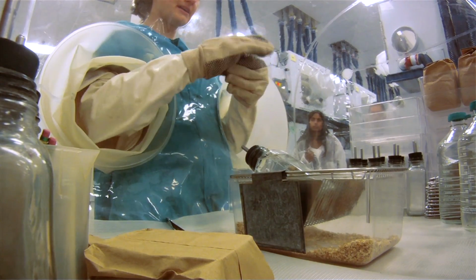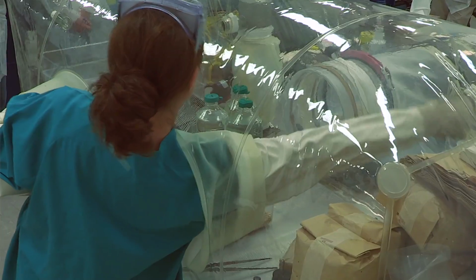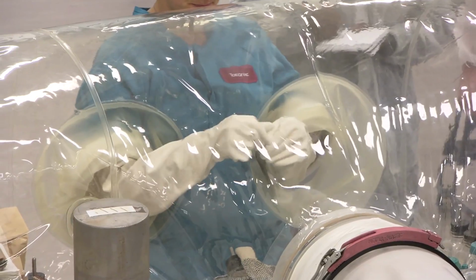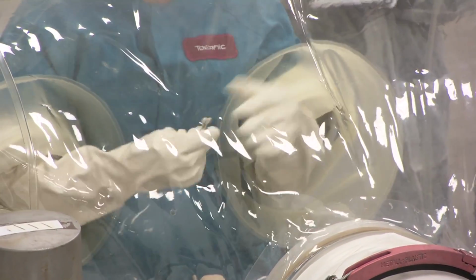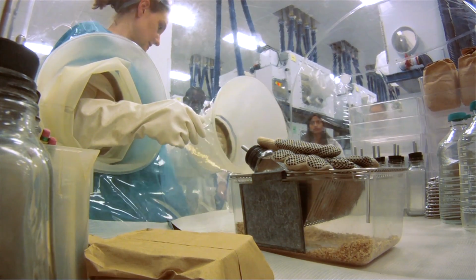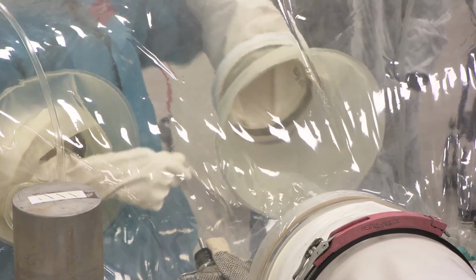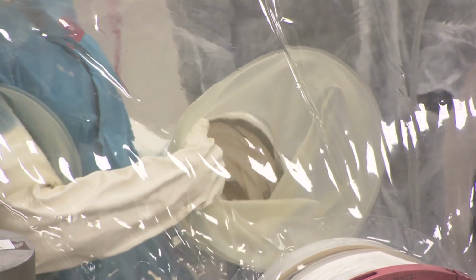And then within the isolator, we swab the filter outlets here. And then we'll also remove our gloves, and I'll swab all of the fingers. And then around our seams in here. And lots of times right here where these rings are, bedding will get stuck. So this is a good way to kind of get it cleaned out, because oftentimes this seems to be the worst spot for getting holes, because the bedding will sit there and it will poke right through. So at least with this, you're getting it cleaned out a little bit.